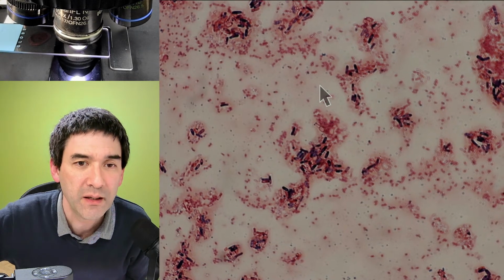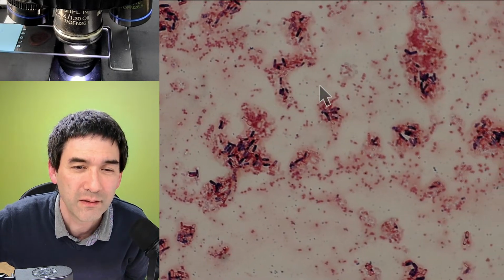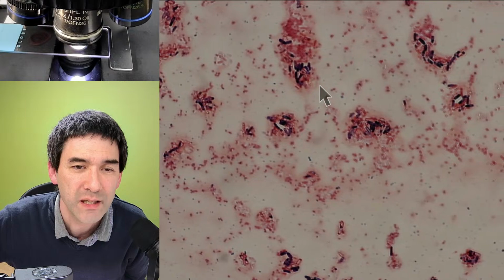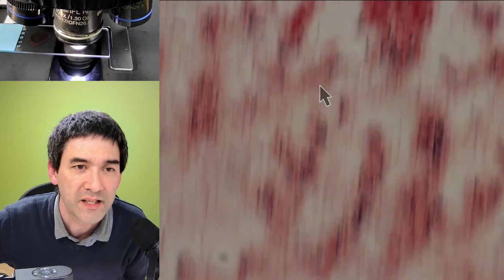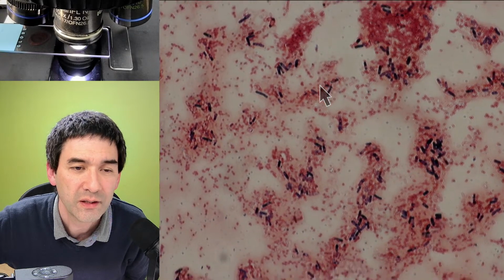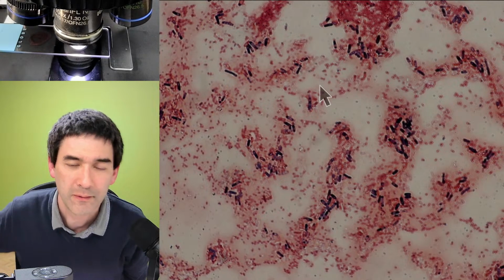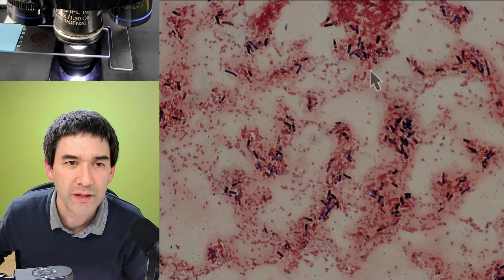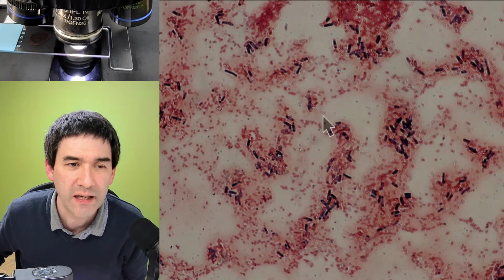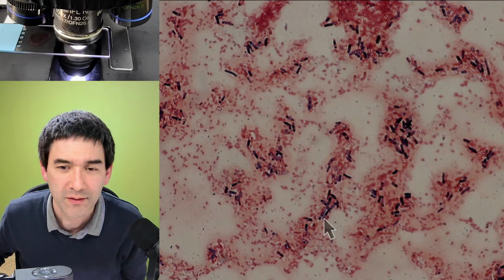I'm quite happy that, because of the contaminants on my plates, you can actually see that there's a mix of different bacteria, and they don't only stain differently, they also have a different shape. See the red bacteria, the tiny ones on the outside, and in between the dark ones are the gram-positive ones.